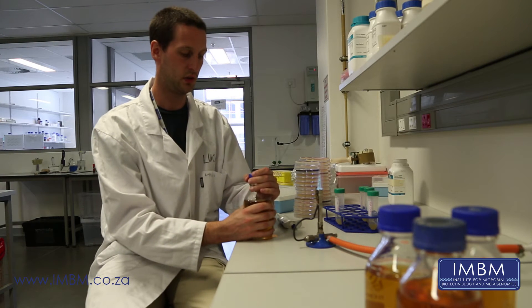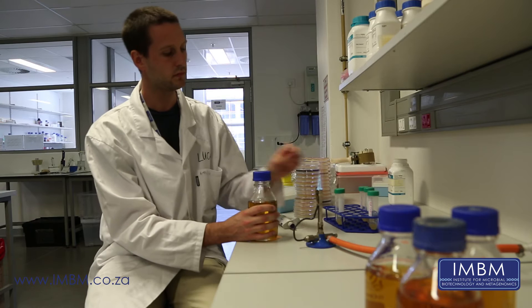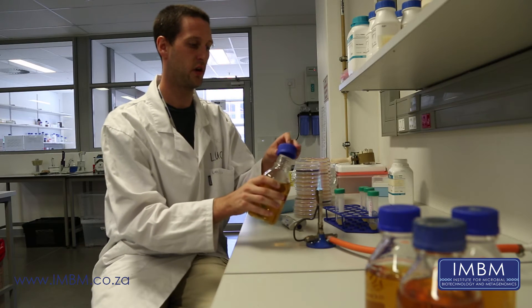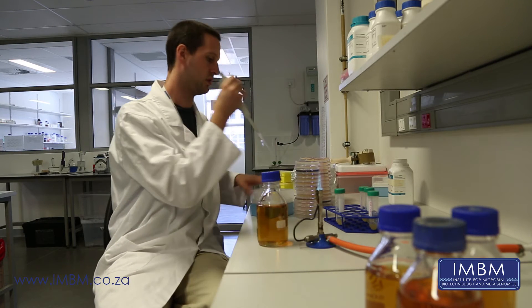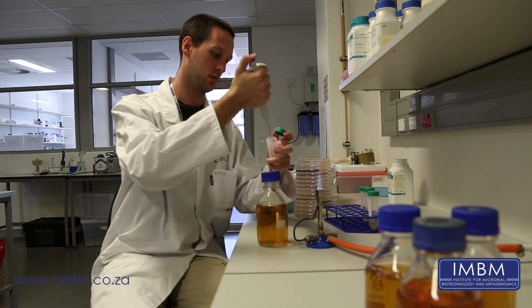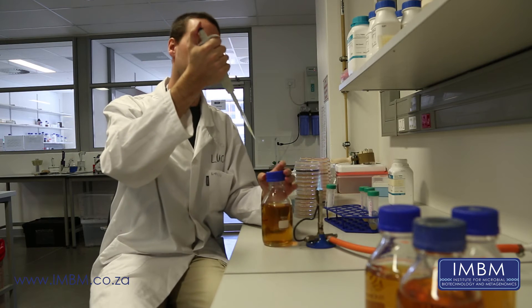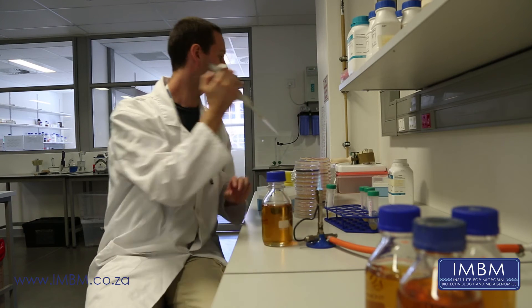First thing to do is add the bacteria. The first bacteria I'm going to work with is E.coli, and that is diluted one in a thousand into the media. Open your bottle, make sure it's sterile. Take a pipette, take your culture of E.coli, sterilize that. Take 500 microlitres of culture and add that to the agar.